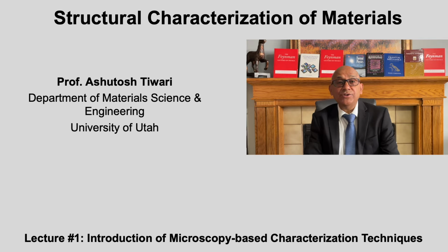In the later lectures, we will return to each of these techniques, including electron microscopy, X-ray diffraction, spectroscopy, and scanning probe methods, and study them in much greater depth, focusing on theory, experimental practice, data interpretation, and limitations.